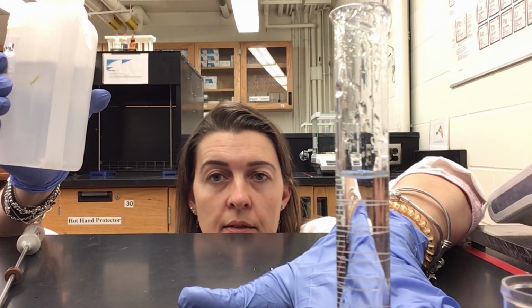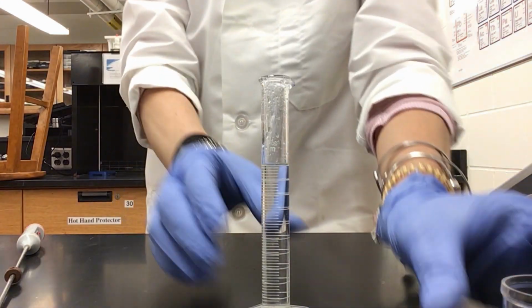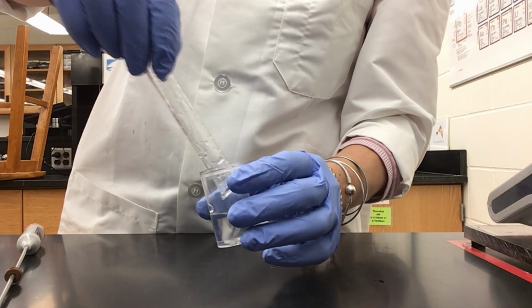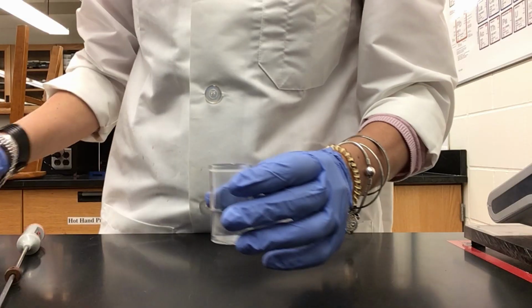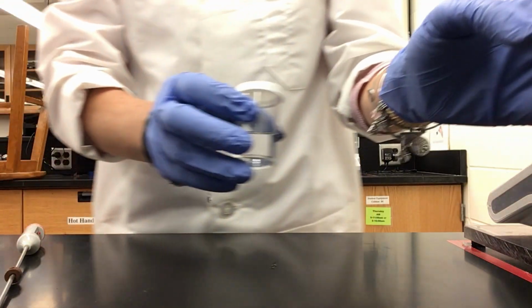Can you see that? Okay. So now I am gonna put it here, shake it again, put the cap on, and weigh it again.